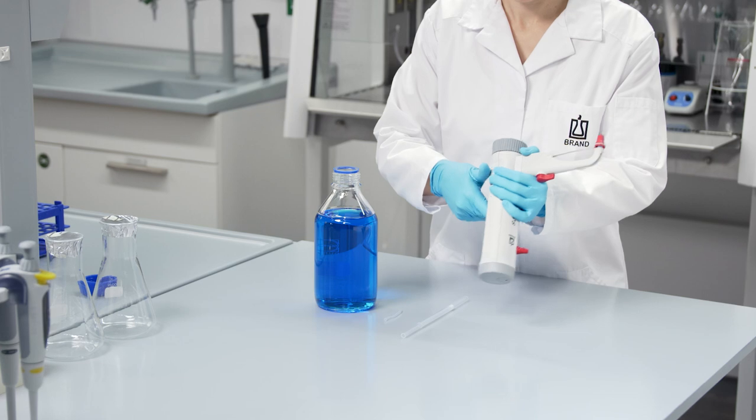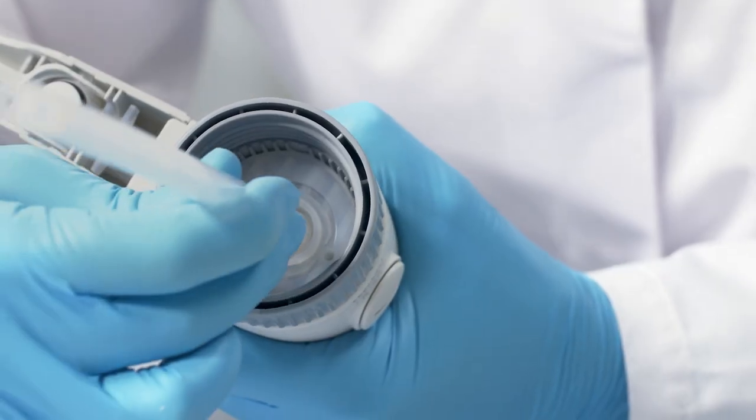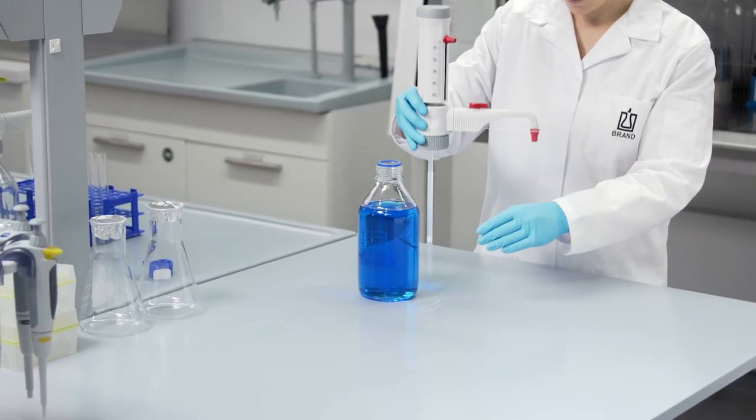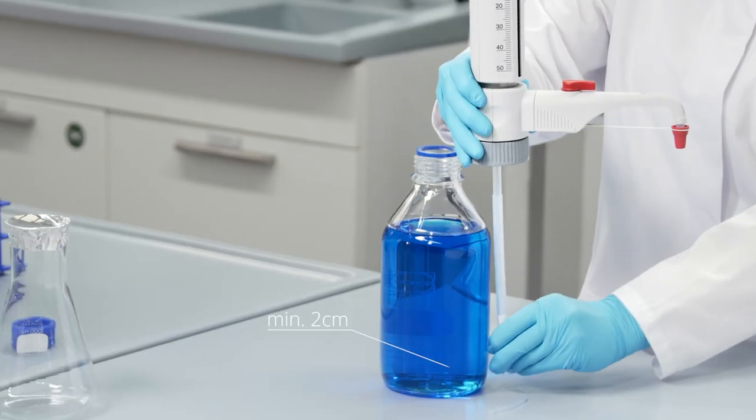Simply adjust the length of the filling tube to the bottle height and attach it. Keep a minimum distance of 2 cm from the bottom of the bottle and avoid aspiration of solids.